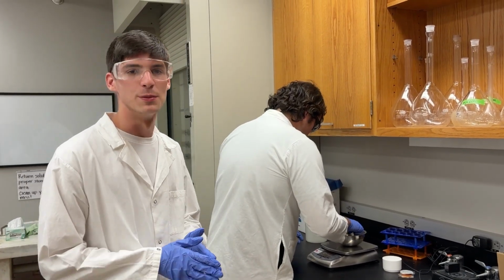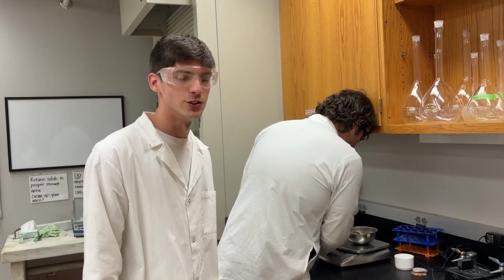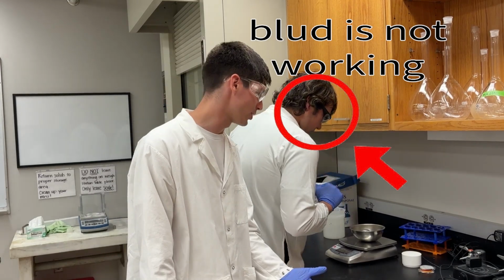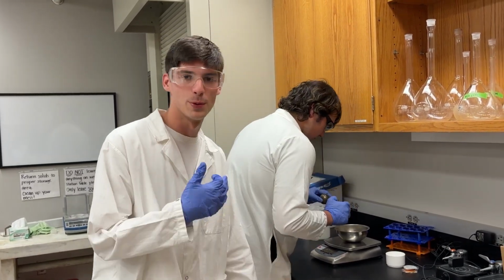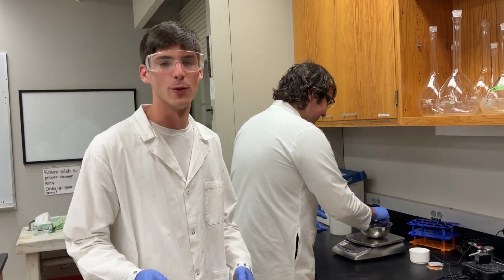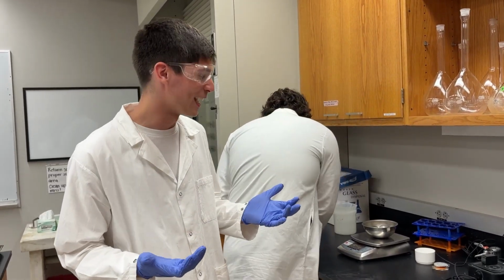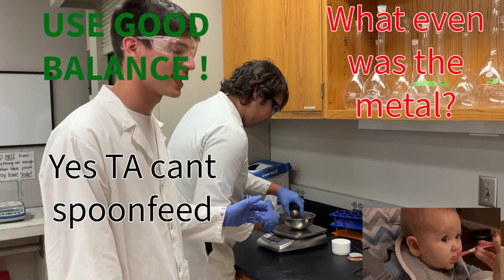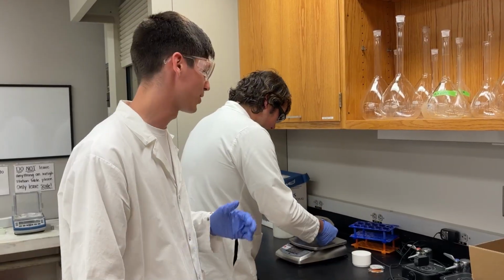In this experiment, it's important to identify the metal that each sphere consists of. To make sure you know what it is, you can do a density calculation by measuring the weight of the sphere and then putting that over the volume of the sphere. You also can ask the TAs about which sphere is which metal, but sometimes they don't always give you the answer. And then you also need to make sure you're using the right scale when doing the measurements, because some of the scales produce an error when you put something on too heavy.